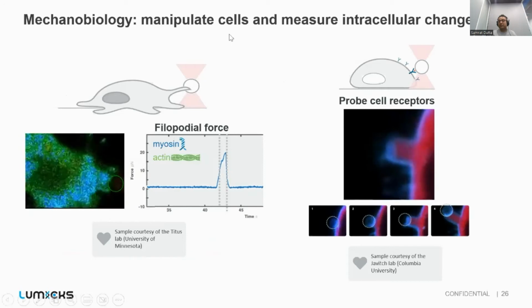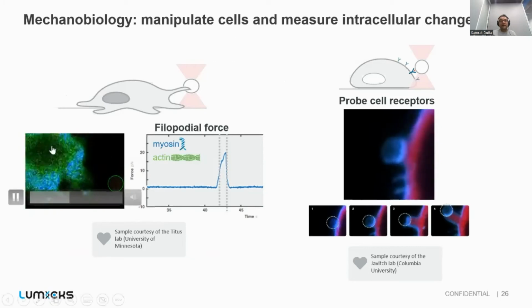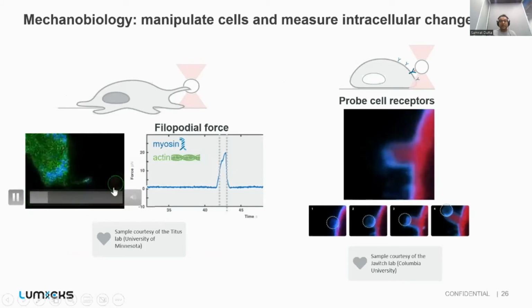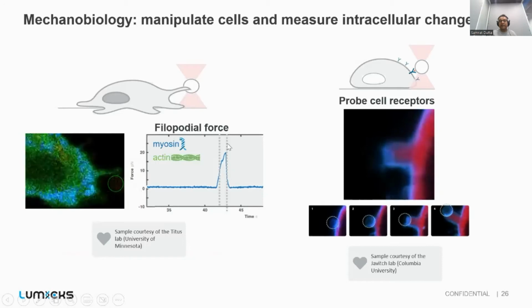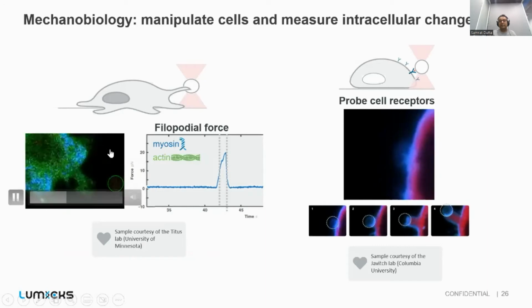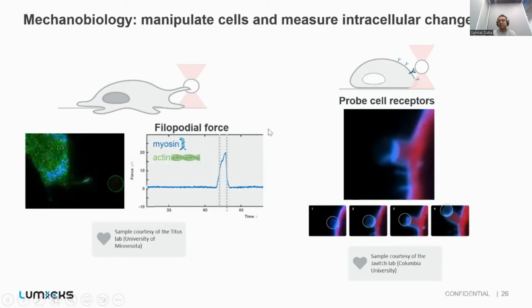And it is also hypothesized that the cancer cells bind more strongly to the members of the microenvironment. On the left-hand side here is a cell which was fluorescently labeled, and a trap bead was brought in the vicinity of this cell. As this cell proliferated, it interacted with this bead, and from this the forces of interaction of the filopodia-like structure from the cell can be measured. It also gives us an idea about the stiffness of the cell as well.